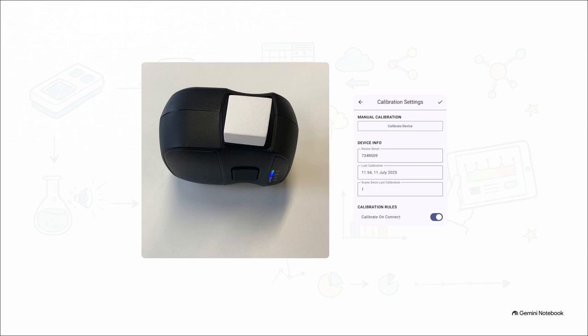And I want to share a really vital tip with you here. If you know you're going to be scanning your samples through plastic bags out in the field, you must calibrate the device through one layer of an empty plastic bag of the exact same type. This makes sure the plastic's material properties don't end up throwing off your final predictions.